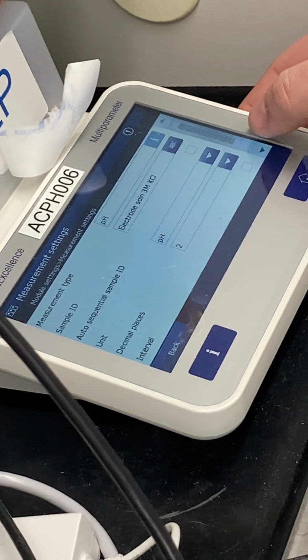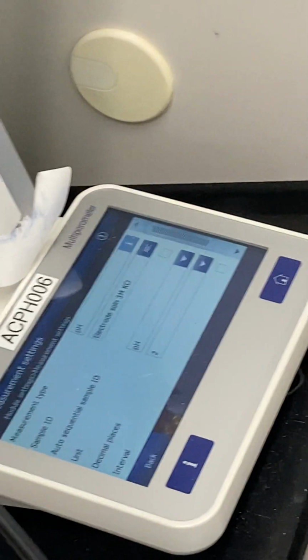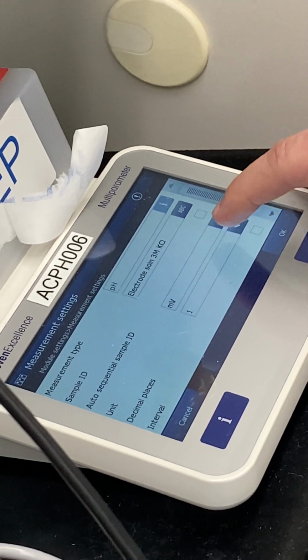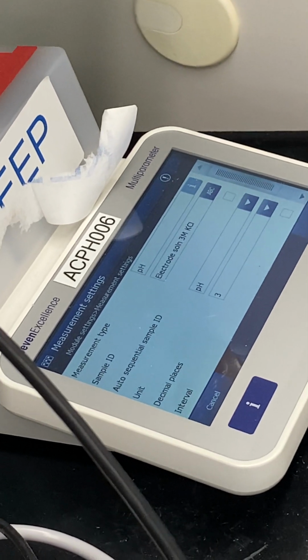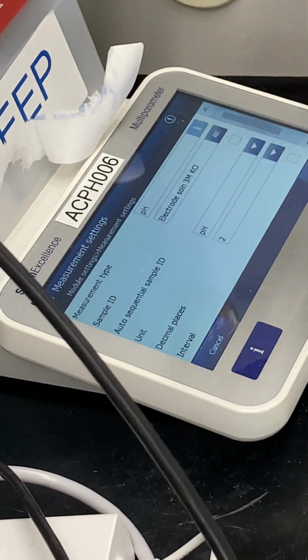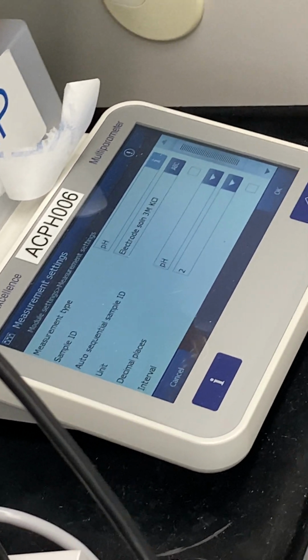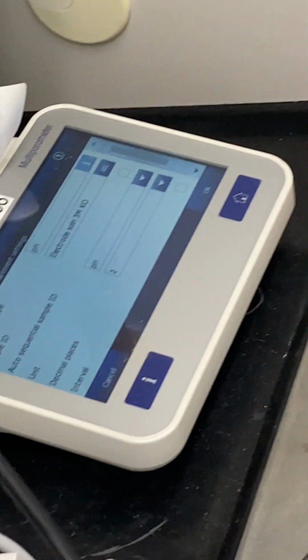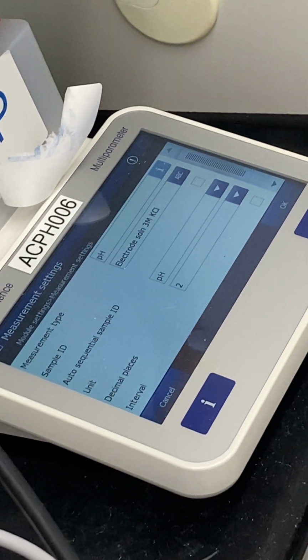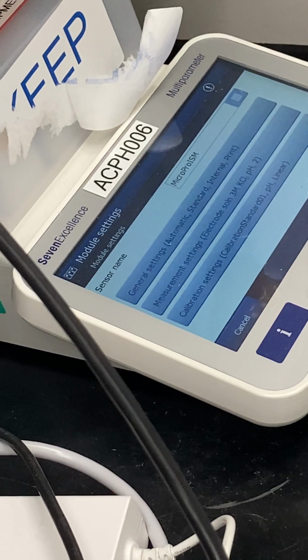Measurement settings, I wouldn't mess with either unless for some reason you need to, maybe you need to do a simulation, so you change this to millivolts. And just make sure you know what it is and change it back later. And then I don't know, if for some reason the client requests a 0.005 tolerance, but they only have it set to 2 decimal places, well, I mean, first off, you'd probably want to let them know, but second would be you could actually change the decimal place there.